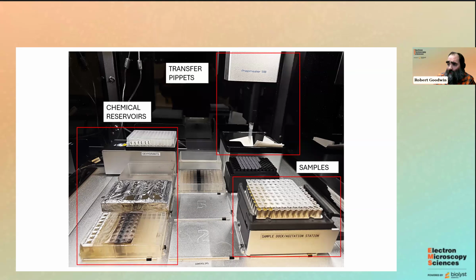If you're going to do those, a lot of people tend to bring them in polystyrene plates. If you're going to do anything with acetone or acetonitrile, you need to have polypropylene, because they don't play well together with polystyrene.